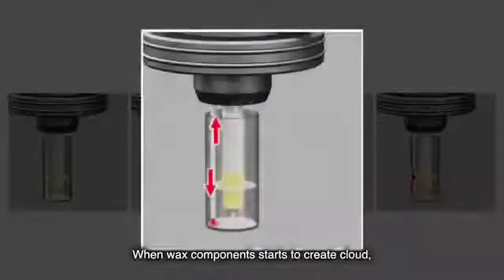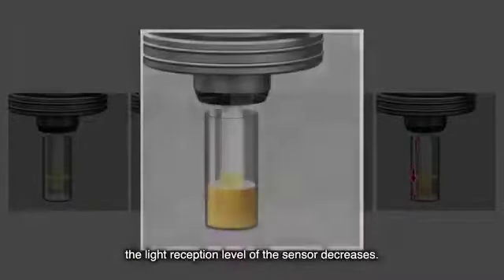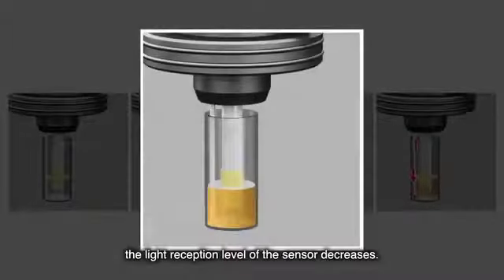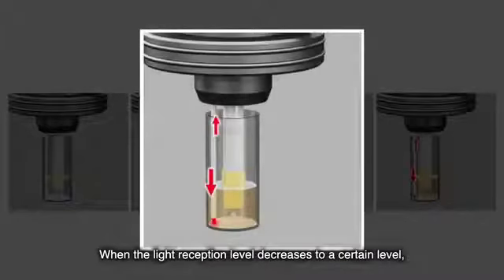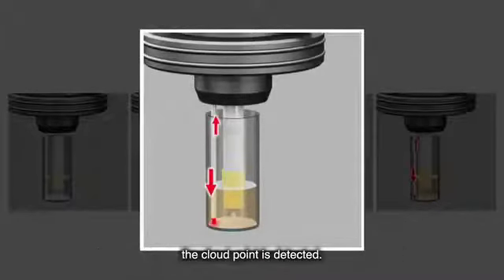When wax component starts to create cloud, the light reception level of the sensor decreases. When the light reception level decreases to a certain level, the cloud point is detected.